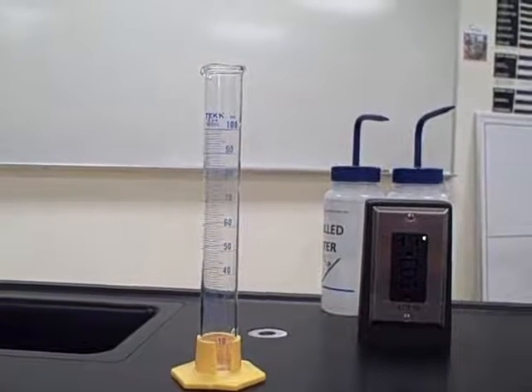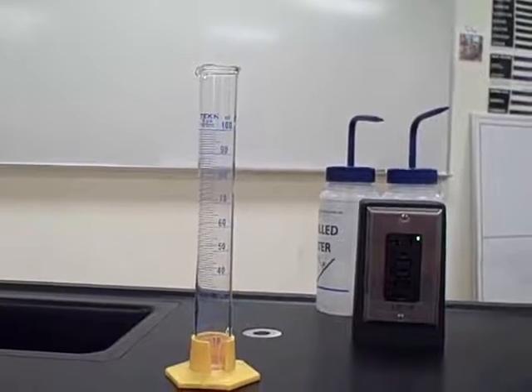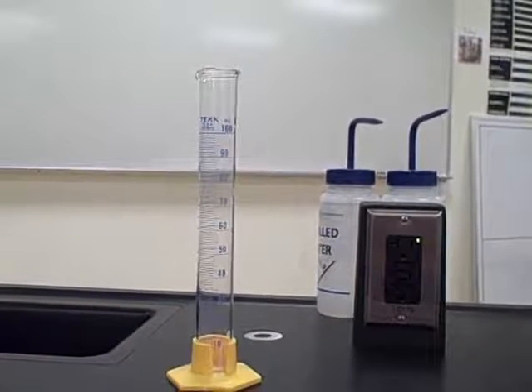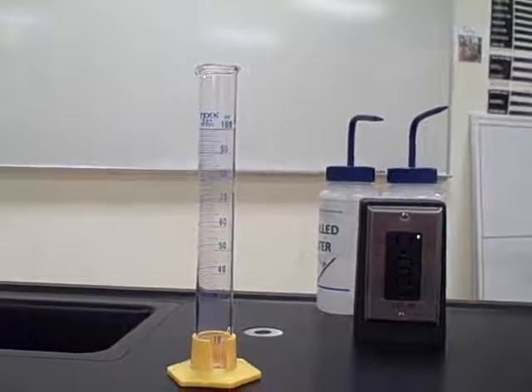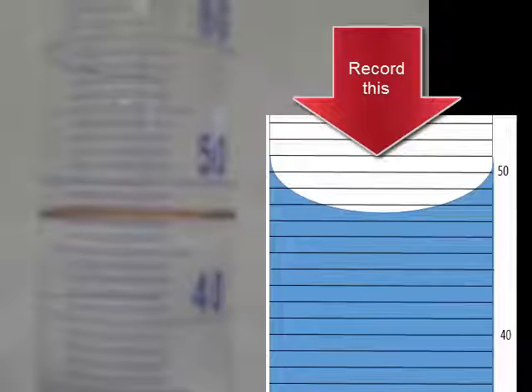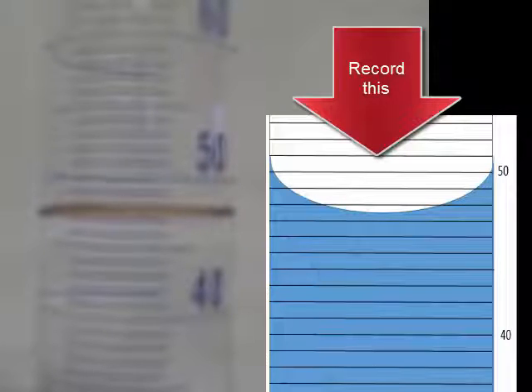Now I'm going to use this 100 mil graduated cylinder to measure the volume of two samples of the salt water. Now accurately record this volume of the salt water in the graduated cylinder, and remember to record it to the correct decimal place.